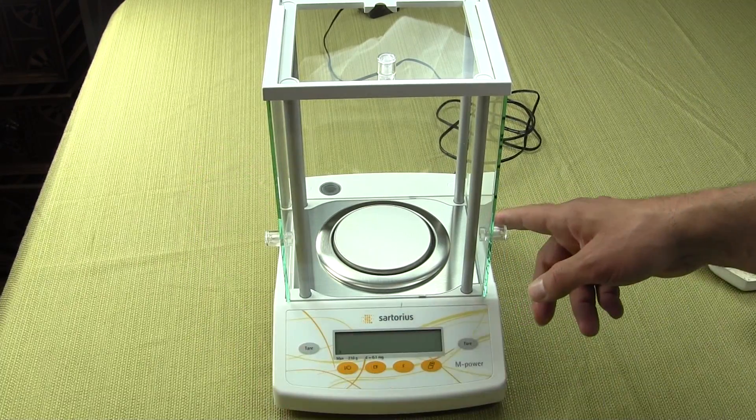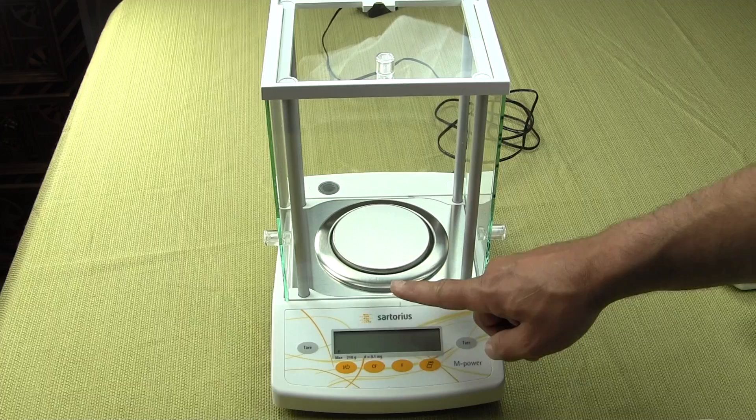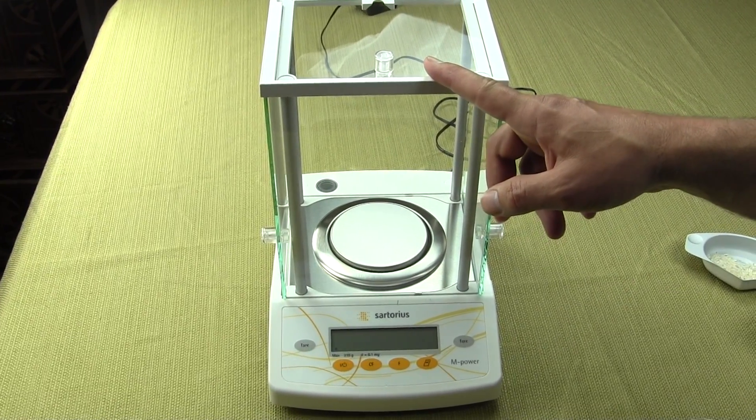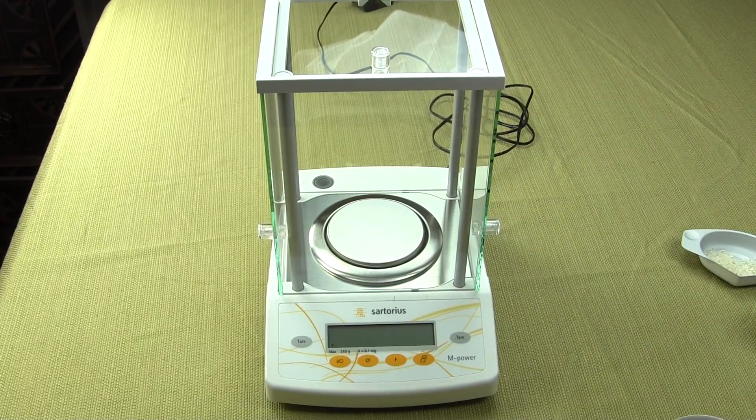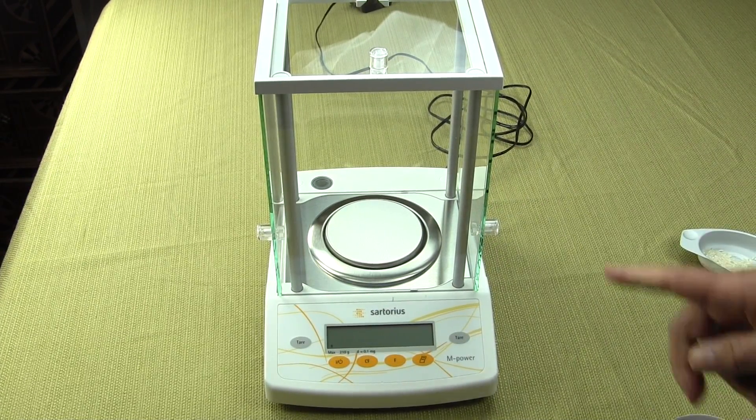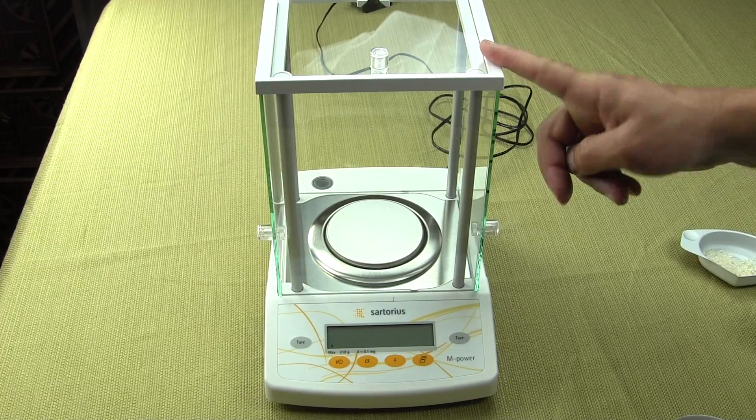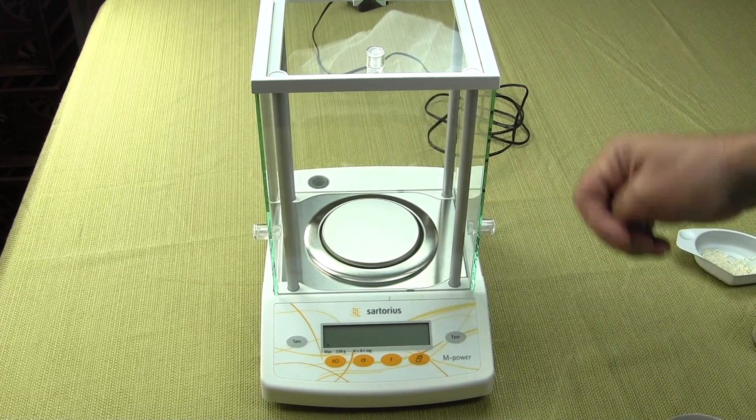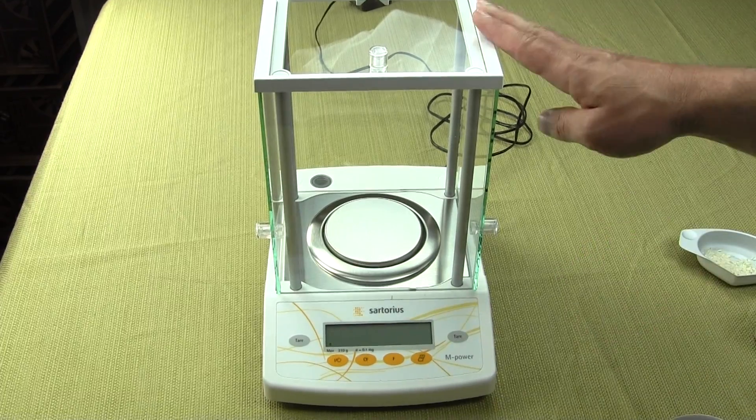Now, the height of the draft shield from the top of the weigh pan to the top of the glass, on this particular model, you would have 7.87 inches. So you do have a tall glass draft shield here. Some people like a shorter one, but this is tall. So it's pretty much a standard in the industry.